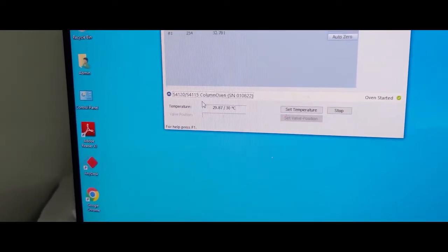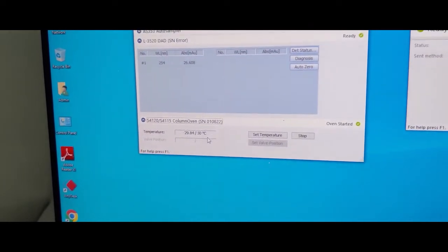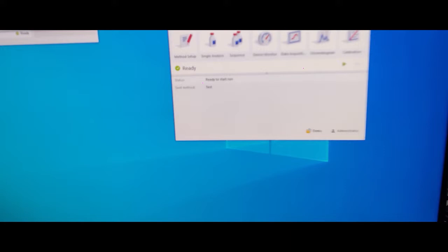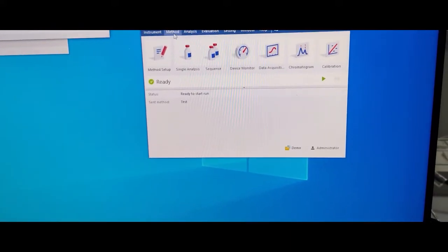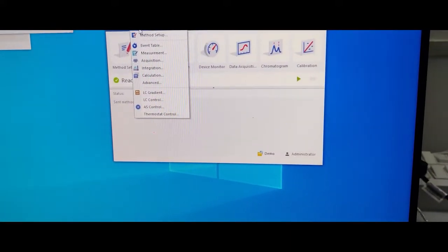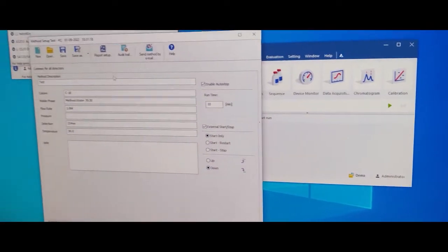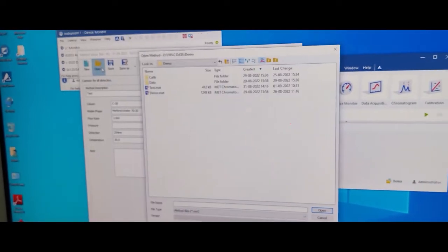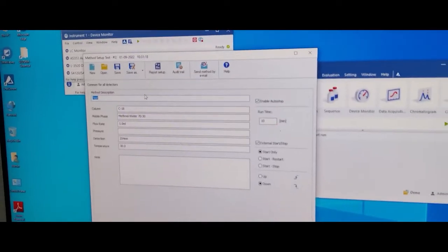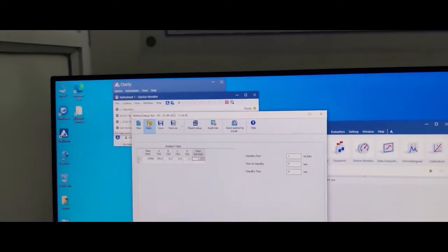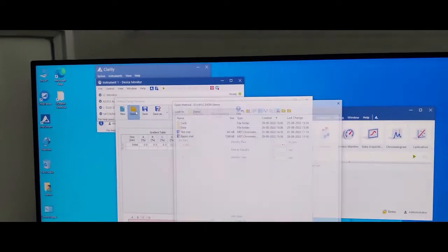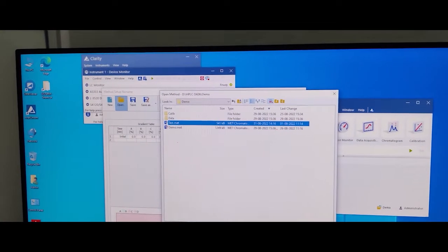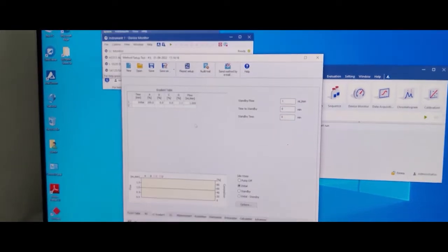Here is the column parameter. Now open the method. Method setup test method. Select the method according to your sample.